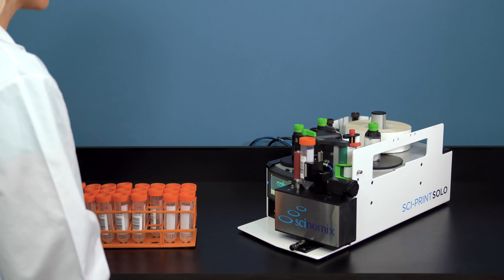The Cyprint Solo offers unparalleled compatibility with a wide variety of tube types and sizes ranging from 0.5 to 50 milliliters, including cryovials, vacutainers, and much more. This Cyprint Solo is built for simplicity, making it extremely easy to use and maintain.